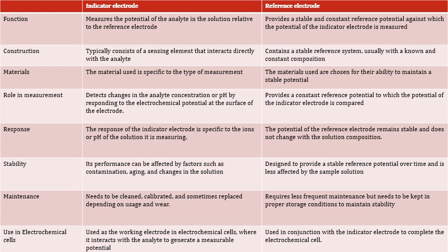While the reference electrode is designed to provide a stable reference potential over time, and it's less affected by the sample solution, it requires less frequent maintenance but needs to be kept in proper storage to maintain stability.